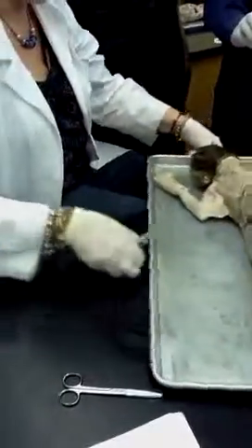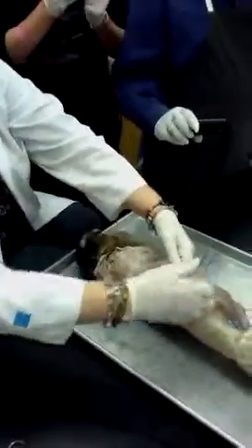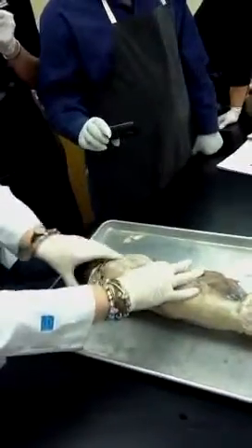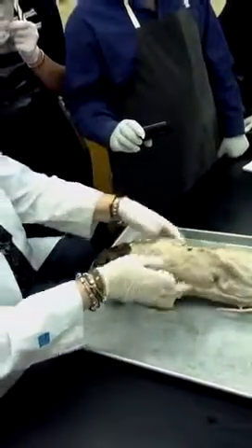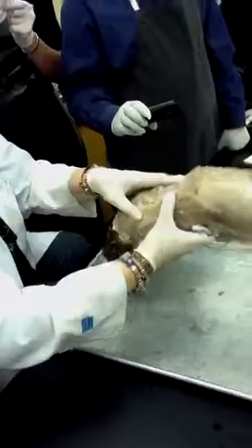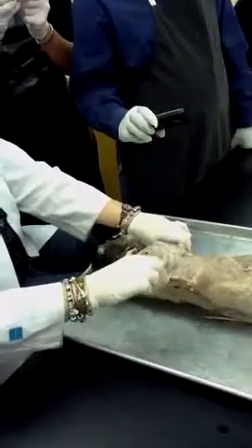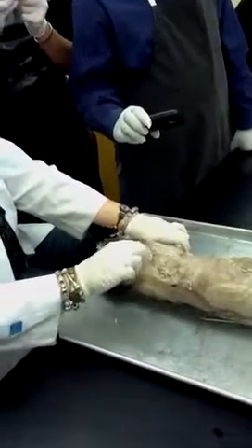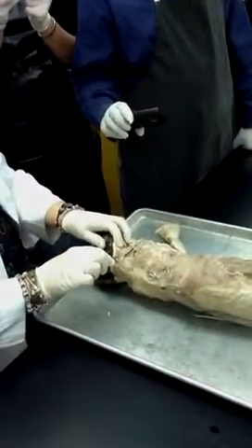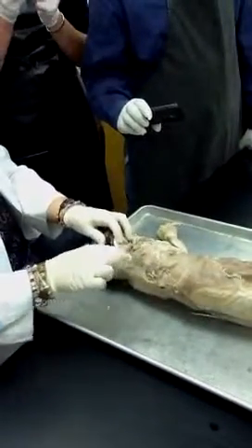Now we can see what we have on this side. First off, this muscle right here is the latissimus dorsi, your lats. In humans we have just one big trapezius, but the cat has 3 insertions for its trapezius. We can see the spinotrapezius, the acromiotrapezius, which is from the acromion process of the scapula, and up here is the clavotrapezius, which inserts in the clavicle.